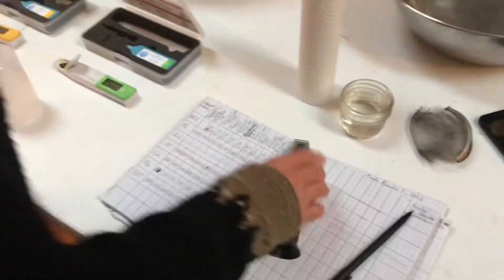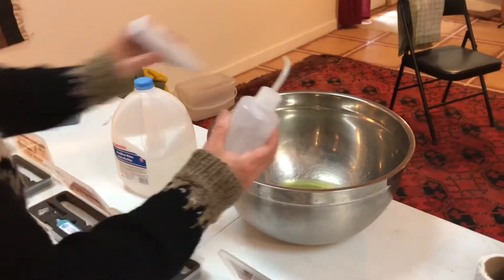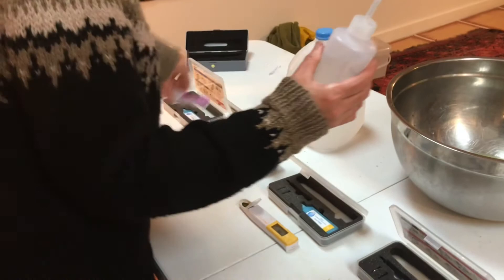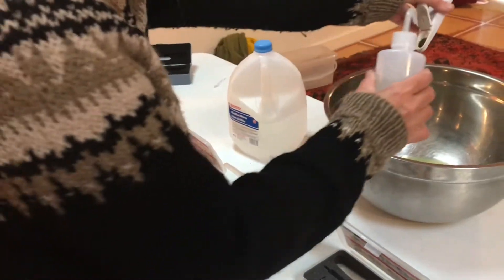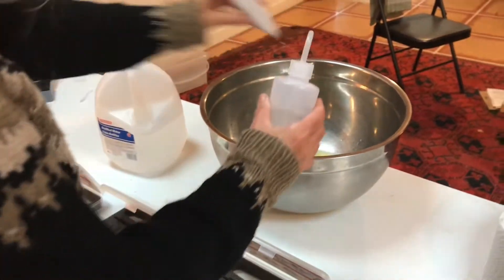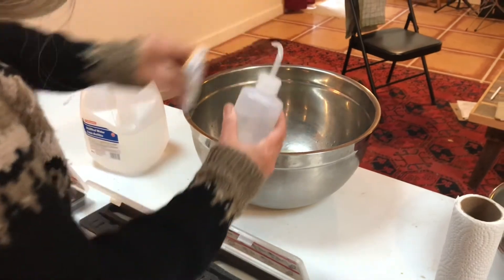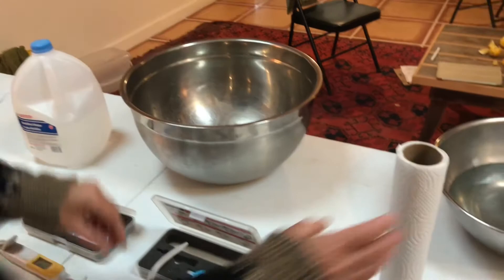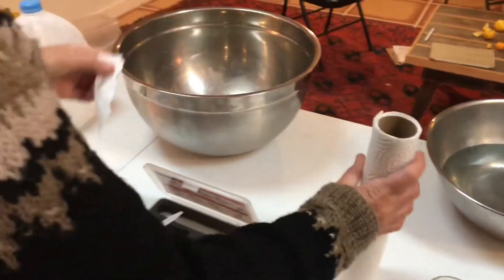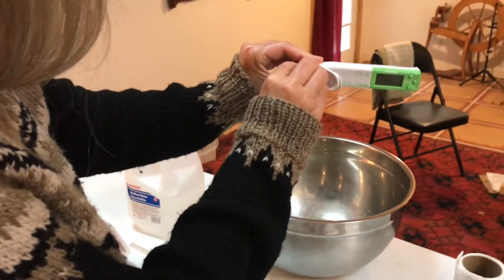Then cleaning — be really careful on how you clean the meters. You're using distilled water and you have to clean them and dry them without touching the electrodes. Then you put them away — turn them off and put them away dry and clean. Being careful along the sides.